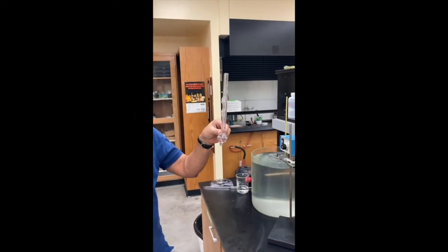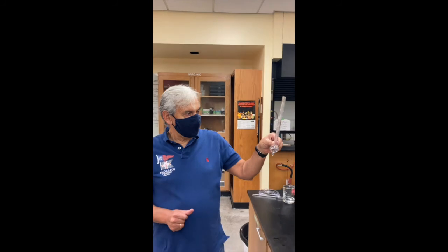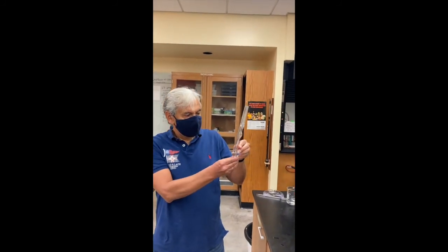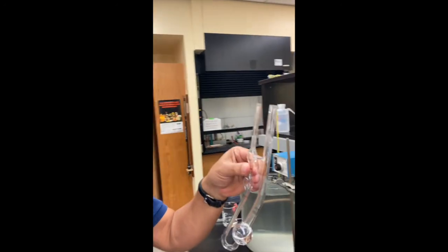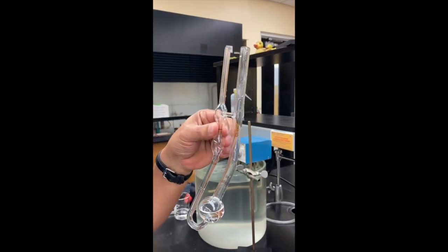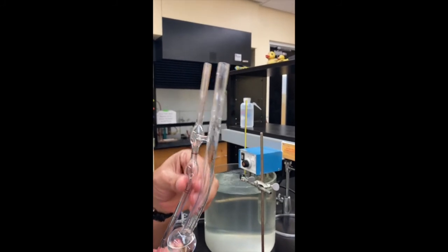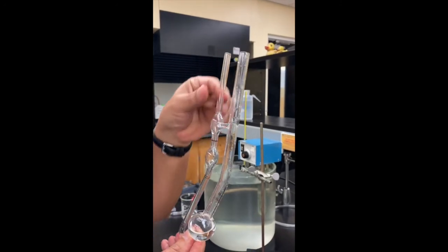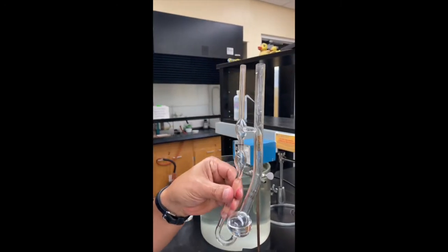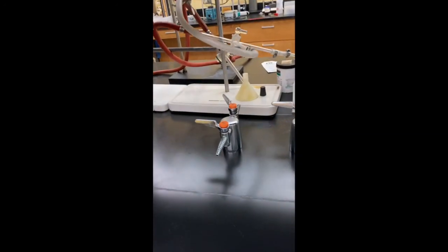Before any measurements and between measurements of different solutions, it's important to carefully wash the viscosimeter, rinse it with acetone to remove any small particles which remain in this tube, and also dry it with air, using the air outlet in the lab.